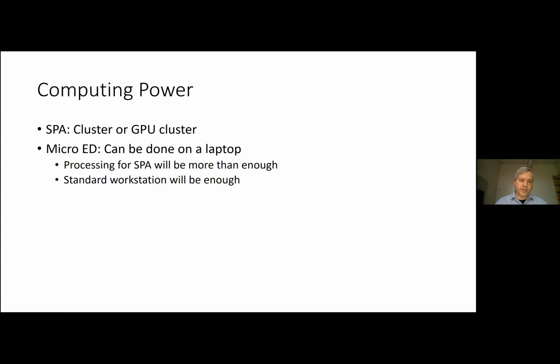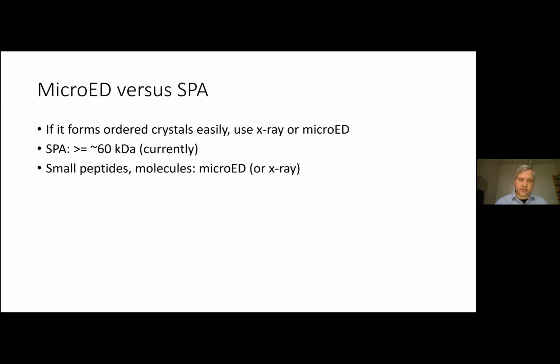Because it's the same technique that's been done for so many years, the power of computing has increased so much that a standard workstation is enough. And by standard, I don't mean a $20,000 one, but probably a $5,000 one is more than enough to do all of this stuff and have graphics too.